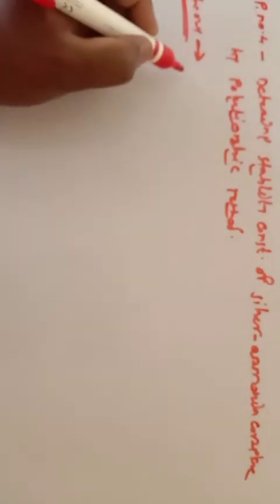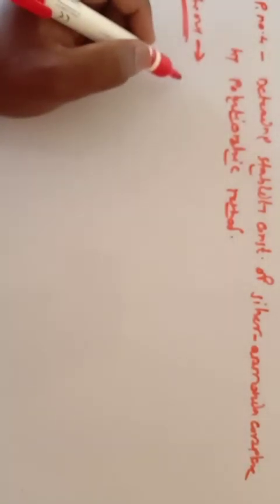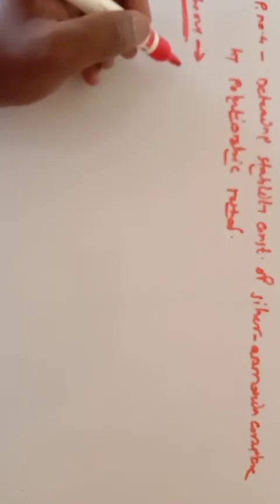So first you have to calibrate the potentiometer instrument.